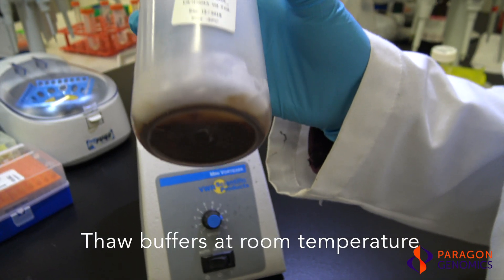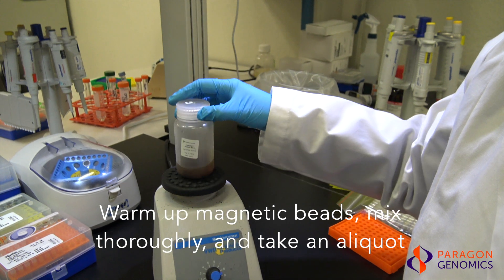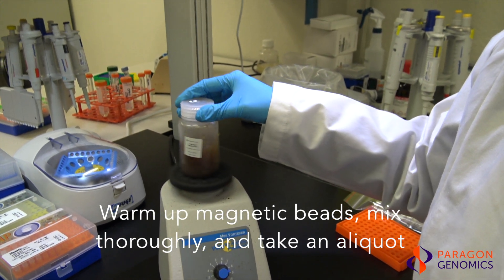First, thaw CleanPlex buffers on the benchtop at room temperature. Second, warm up CleanMag magnetic beads to room temperature for 15 to 30 minutes.